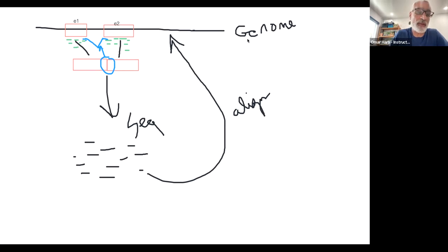And so, of course, you can imagine that this gene model is incorrect. So let's say this gene model is incorrect, and in fact, there's another exon right here. Let's call it, this is exon 0, that really belongs to this gene, but wasn't part of the annotation. And so what's going to happen is when you do your sequencing, you would have gotten lots of reads that came from this region here, right? This fictitious, let's add this exon here. So this hypothetical exon will be spliced right here.